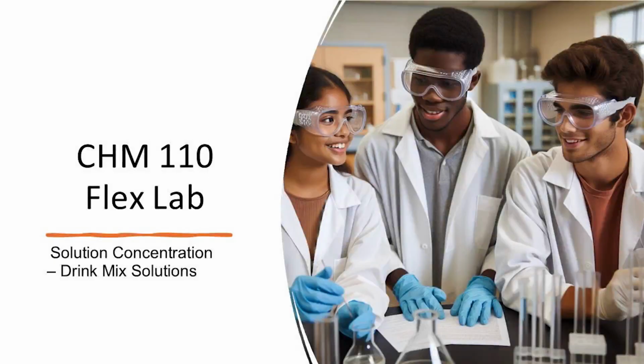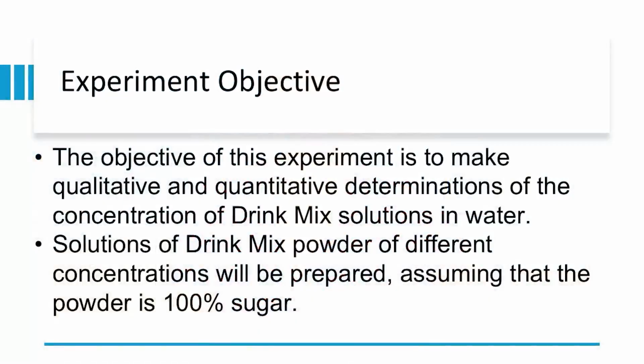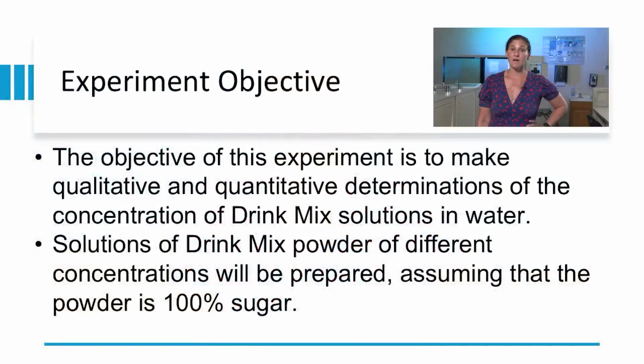Hello chemists, today we're going to do our lab on solution concentration using Powerade solutions. The objective of this experiment is to make qualitative and quantitative observations about different solutions of Powerade. Different concentrations of Powerade solution are going to be made with water.